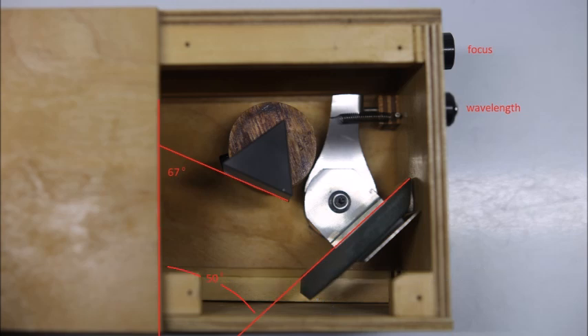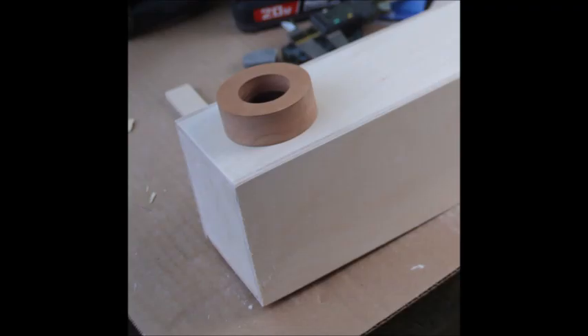Here is the finished back end of the spectroscope, showing the tilt angles of the prism and mirror, and also the wavelength and focus knobs. For the eyepiece holder, I cut a donut out of cherry wood with an inch-and-a-quarter inside diameter and tapped a set screw for it, before giving the whole spectroscope a coat of varnish. The pick-off mirror is centered underneath the eyepiece holder and mounted with 3M tape.